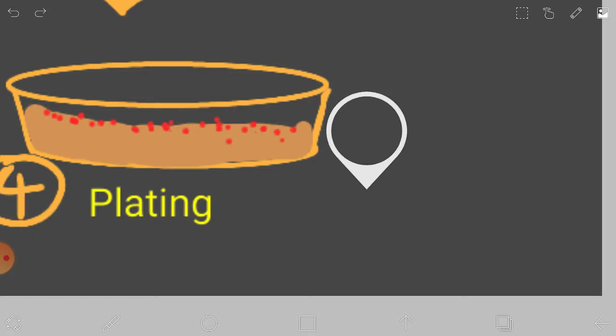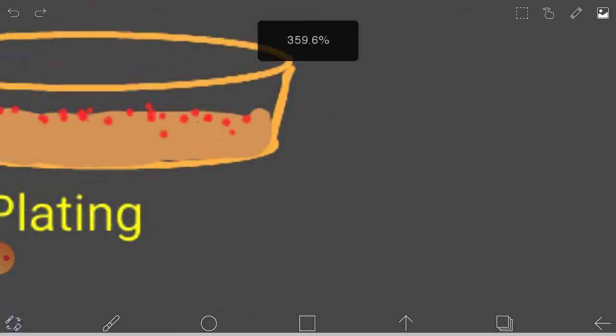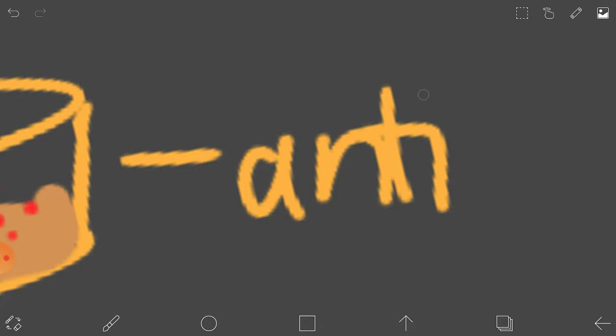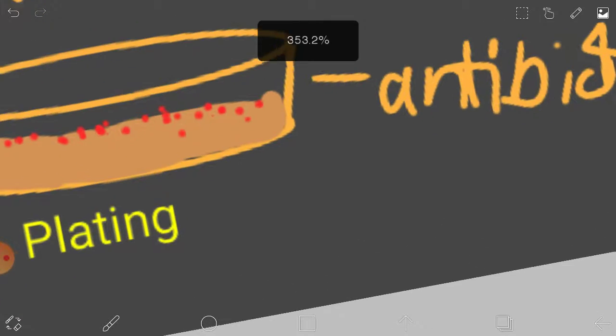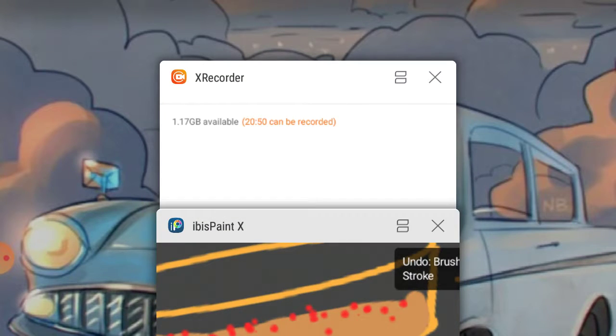That always has some antibiotic, because usually the plasmids are placed into the bacteria so that it could begin to accumulate its abilities or whatever.